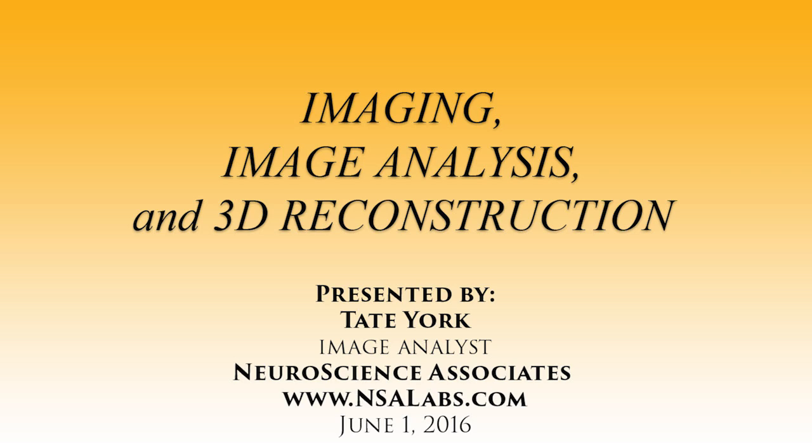I'll talk about our imaging capabilities and services, go over some of the equipment we have in-house, and then I'll go into a little bit more detail about the image analyses that we offer, including particle analysis, densitometry, volumetric calculations, and we'll finish up with a really fun topic that we've been enjoying a bit recently with 3D tissue reconstruction. So I'll go over a little bit of the processing steps and show you some examples of a pig brain and grizzly bear brain that we've reconstructed in recent months.